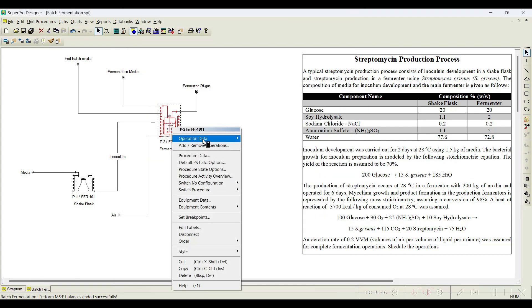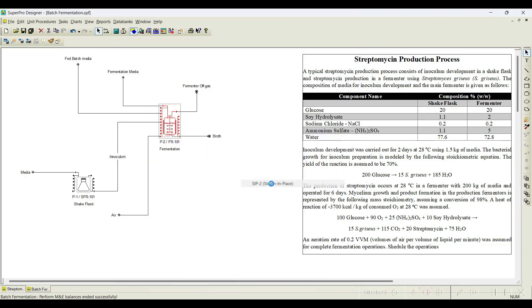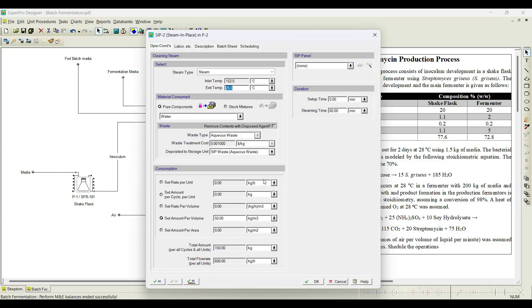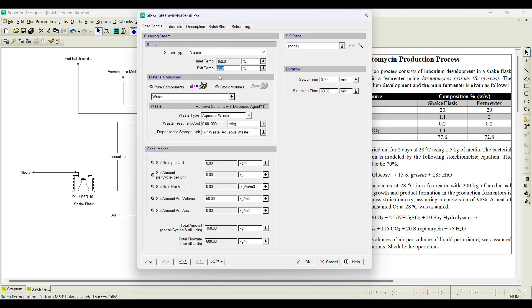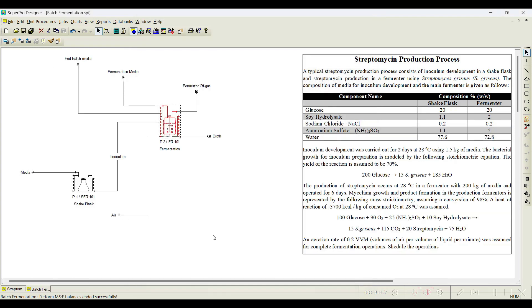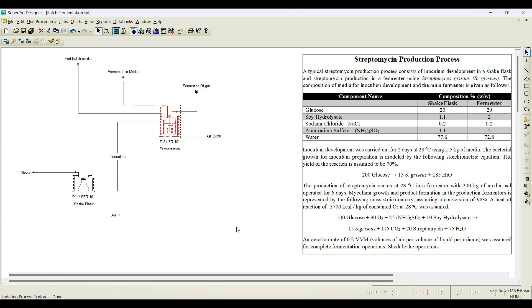One more thing we need to initiate is the post-fermentation steam in place. Here again all these things are default values; I will steam it for 10 minutes. Click OK and run the simulation — mass balance ended successfully.